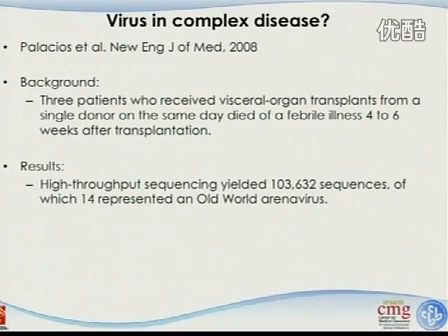It's really not toward scientific discovery, right? They want to know the reason. I think this was published in early 2008, so probably the experiment was done sometime in 2006 or 2007, at a time when Illumina was not there yet. For those of you who don't know, the first commercial sequencer was the Roche 454. It was released in 2006, Illumina in 2007, Solid in 2008.